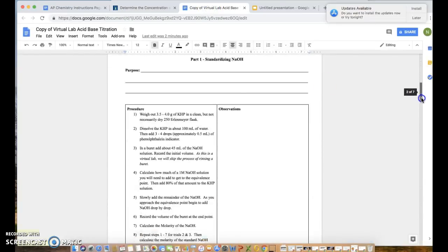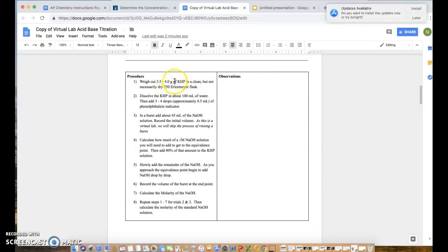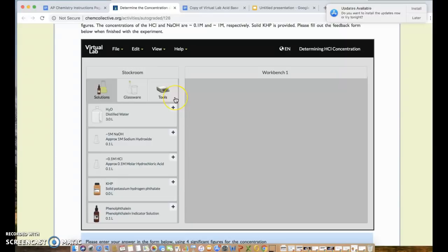According to our procedure, the first thing we need to do is weigh out 3.5 to 4 grams of KHP in a clean but not necessarily dry 250 mL Erlenmeyer flask. That last part is a note for actual lab use — a recently rinsed flask is fine because for KHP the moles are determined by mass, not by volume or concentration of solution. KHP is a solid acid, and we need 3.5 to 4 grams of it.